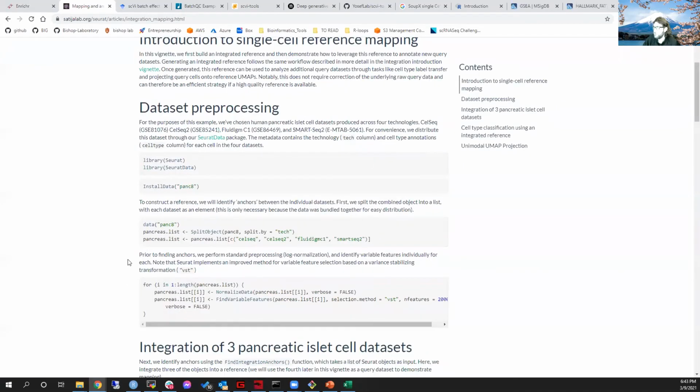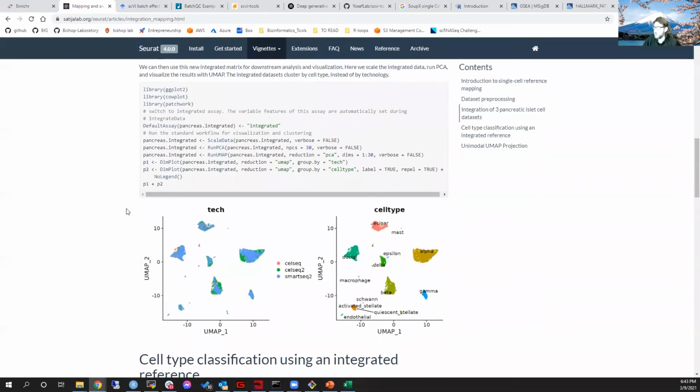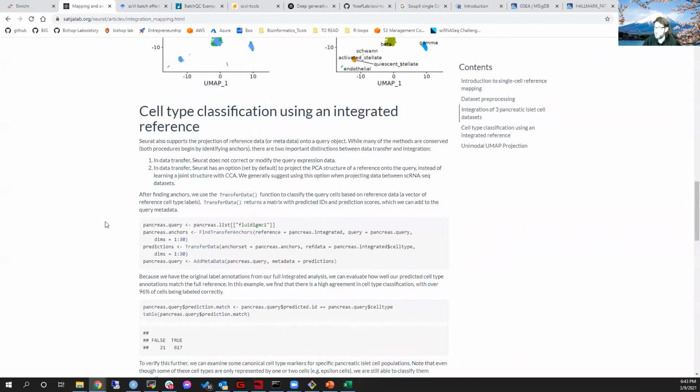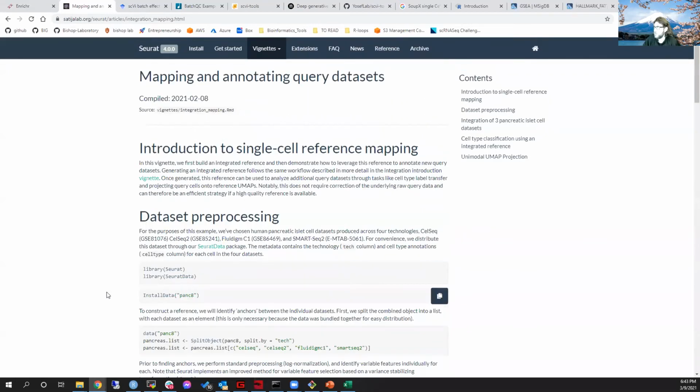And there's an entire tutorial on how to do it here. I didn't go over it because it's just not something that I think most people are trying to do yet, but I think it's a great way. And it's actually something I'm using right now. If you want to see how to do it, you can go here. I'm also happy, if someone wants to see how to do this, to show this in the next week's, or I should say in the last week's presentation.